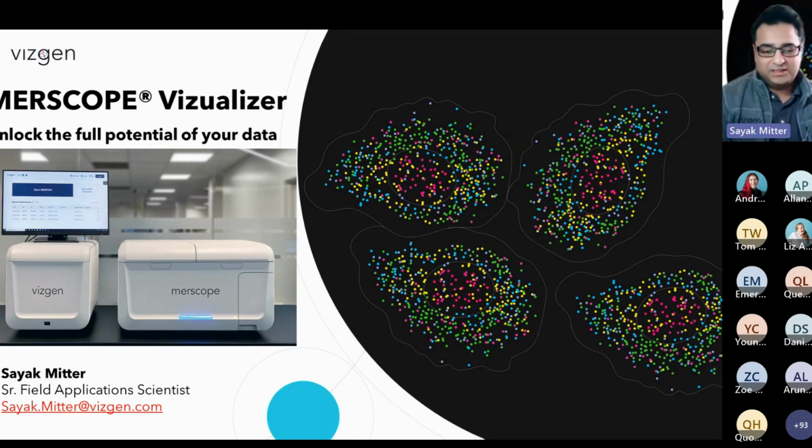So this is not locked by any licenses. We just ask you to register your username and register the installation on your computer, and you are pretty much good to go.